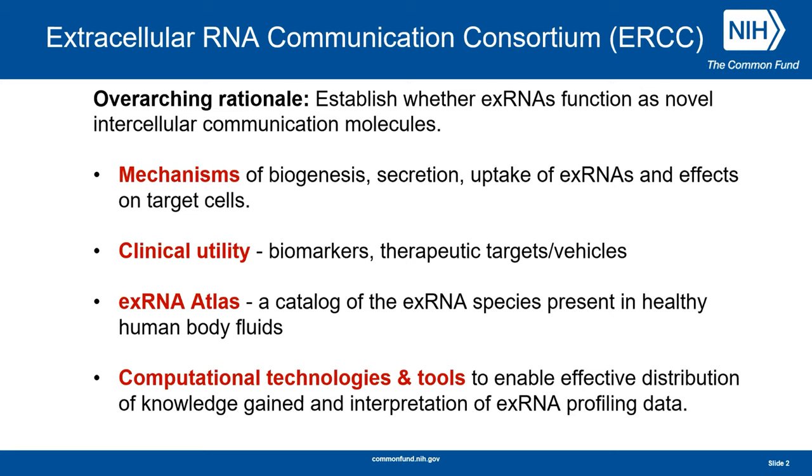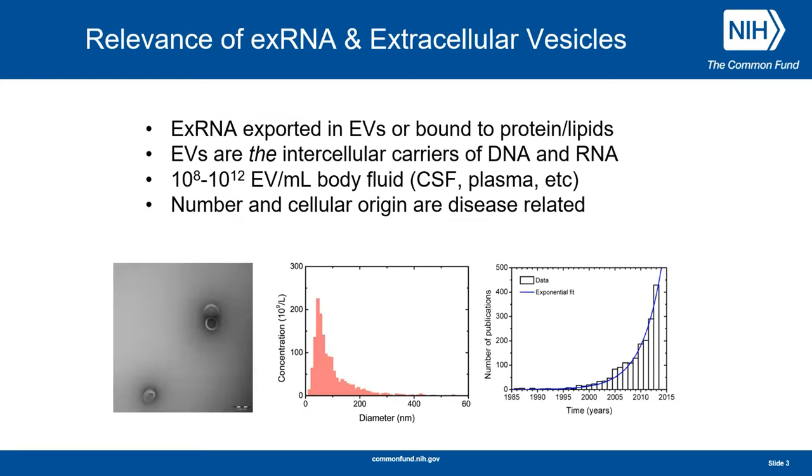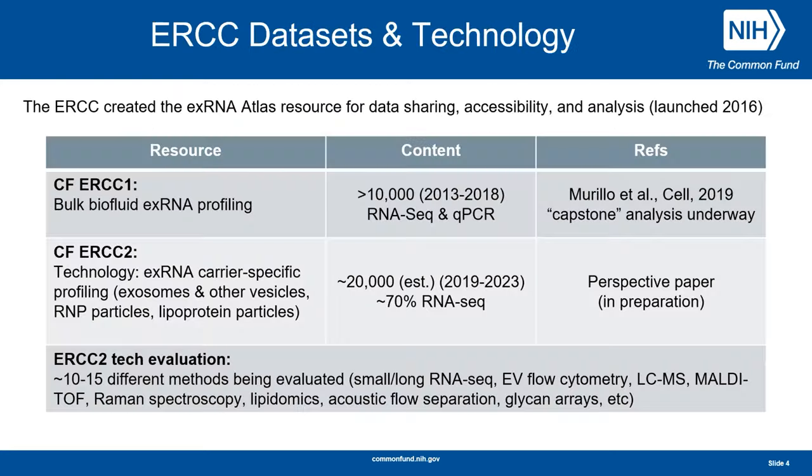We created that exRNA Atlas, but along with that, we also developed different computational tools. These are integrated within the Atlas. One could go to the Atlas, identify data sets or data files of interest, do searches, and then download that data or submit it into these various tools. A number of those tools will be covered by others during the course of this workshop. So this has been covered. Basically, as data is being generated, where does this go? So we created the Atlas.